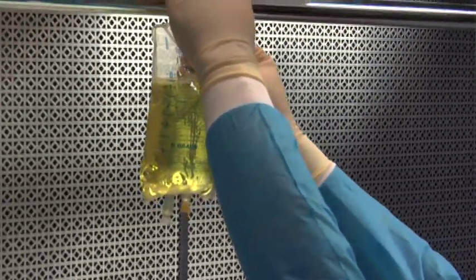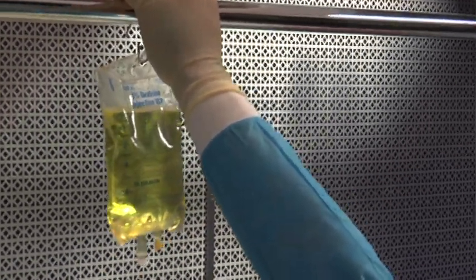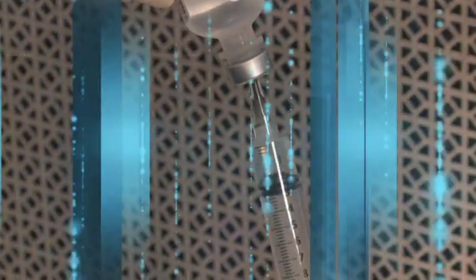Patients who receive IV medications are more susceptible to infections than the rest of us because they're already sick, which is why we use special procedures and precautions when compounding IV medications. Now, these procedures and precautions make up aseptic technique and help minimize the risk of microbial contamination from pharmacy-prepared sterile medications.